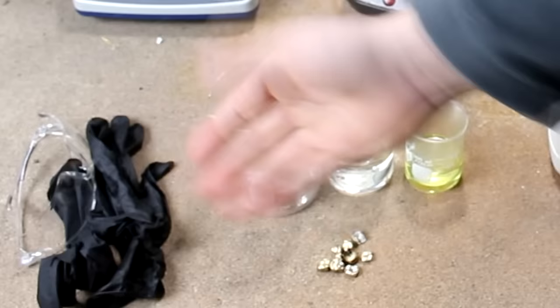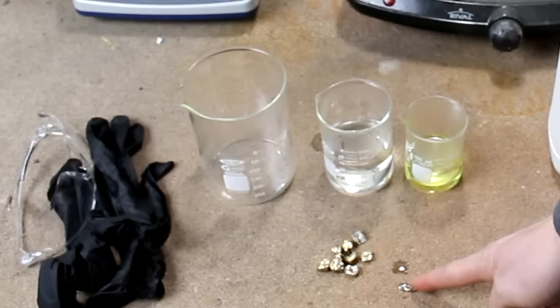I've also got a large beaker here to perform the reactions in. I also have some gloves and safety goggles, which is a pretty good idea to use, especially if you don't like the idea of getting corrosive chemicals on your skin.